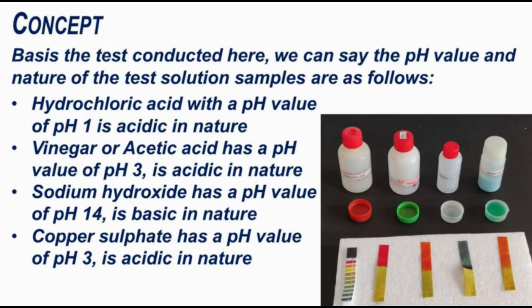Vinegar or acetic acid has a pH value of 3, which is slightly weaker than HCl. Sodium hydroxide has a pH value of 14 — observe the dark green color — that is a strong base. Copper sulfate has a pH value of 3, which is also acidic in nature. In this activity, HCl is a strong acid and sodium hydroxide is a strong base, depending on their pH values.